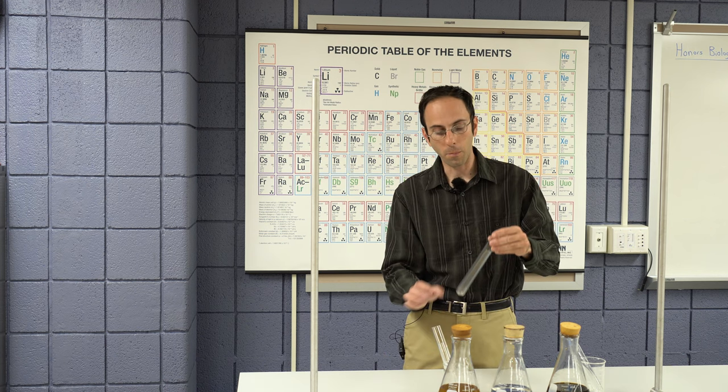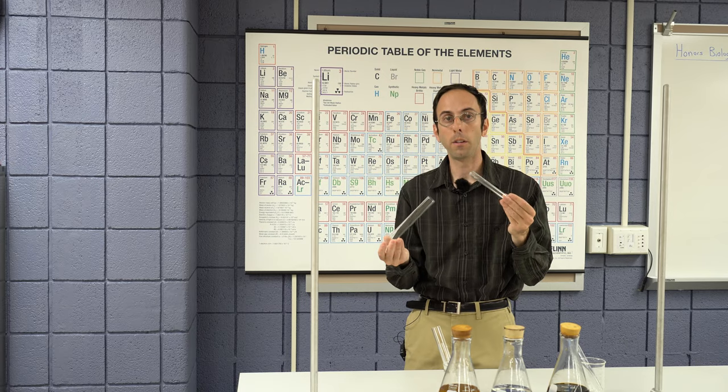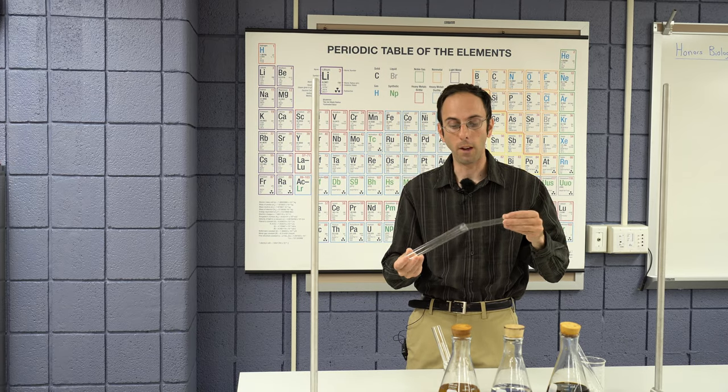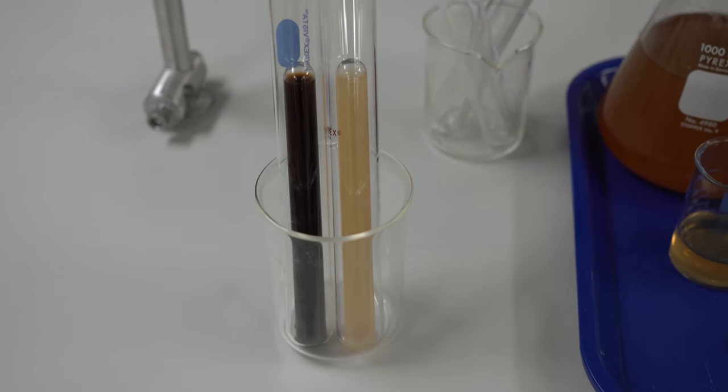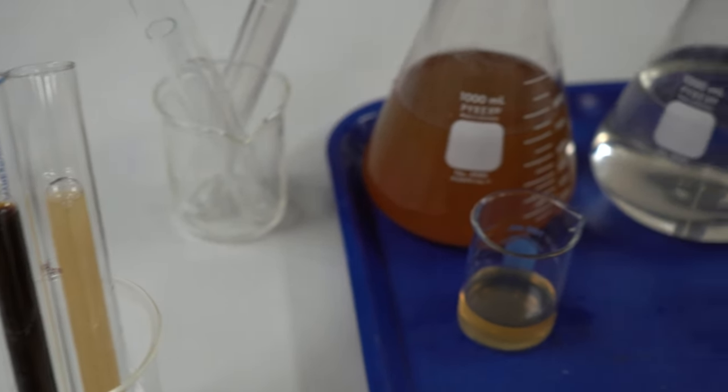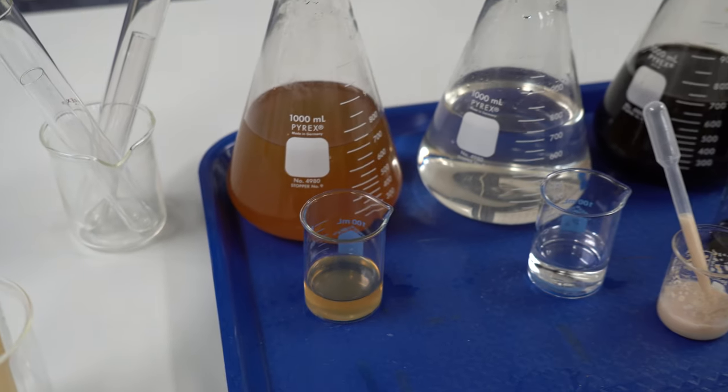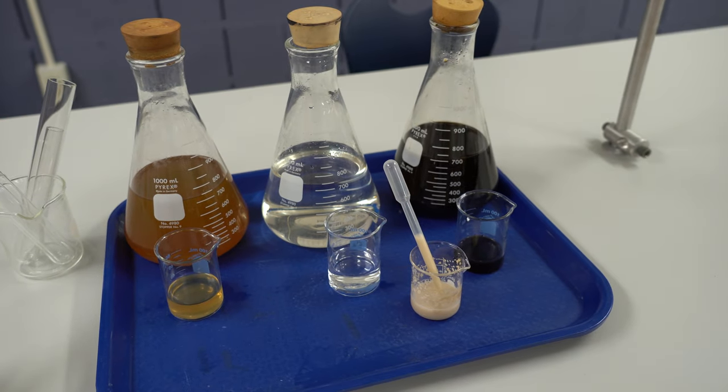We're going to be using fermentation test tubes. These are large test tubes and regular small test tubes. I'm going to show you how we're going to set these up. This shows the basic lab, how it should look in the end with our molasses and honey solutions. We'll also be preparing our refined sugar. Here's our stock solutions of honey, refined sugar and molasses, as well as our yeast suspension ready to go.